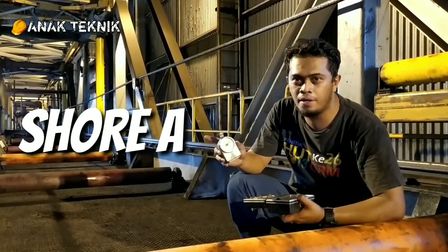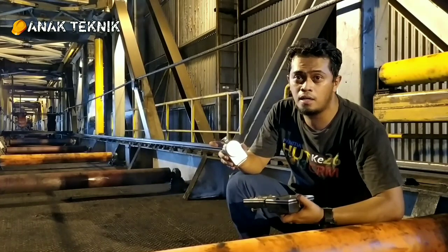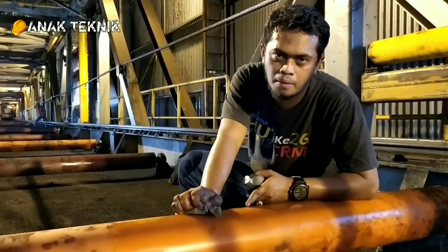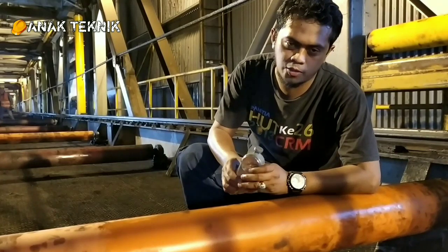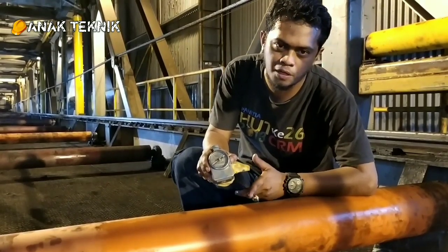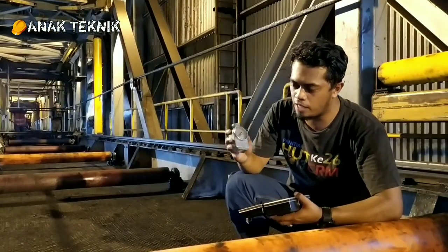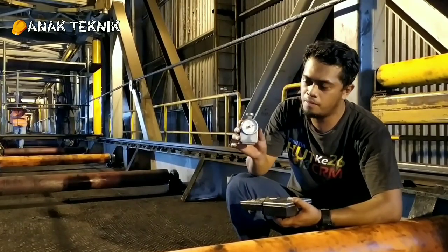Shore A itu aplikasinya biasanya untuk rubber, kemudian untuk poliuretan, untuk teflon. Kalau Shore D biasanya untuk keramik, kemudian untuk acrylic, kemudian untuk material-material keras lainnya. Untuk roll ini sendiri biasanya nilai standarnya adalah 80-90 Shore A. Nanti akan kita buktikan, akan kita ukur dengan durometer ini, berapa nilai kekerasan atau hardness dari poliuretan atau PU ini. Nanti akan kita saksikan benar tidak kalau 80-90 Shore A.